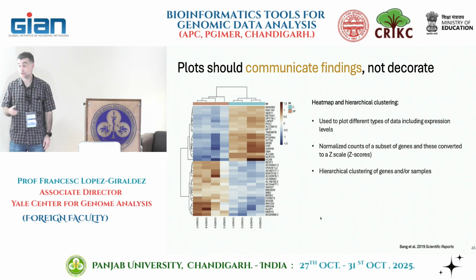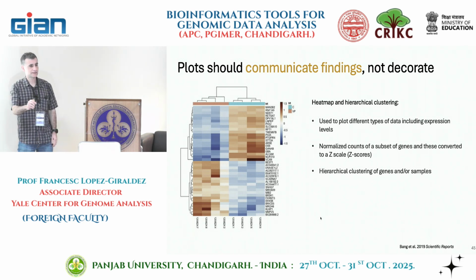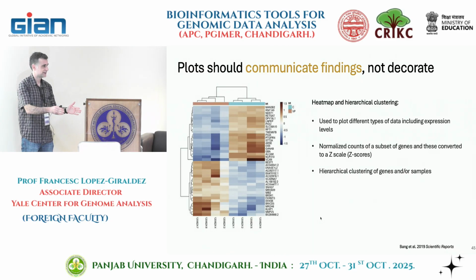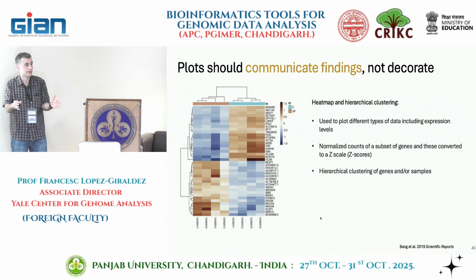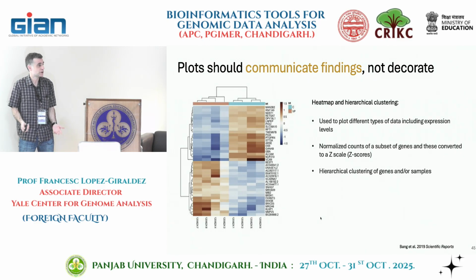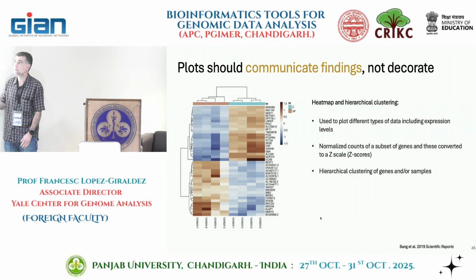I've seen papers, and I think this is one of them, that say, oh, I'm plotting a heat map with the genes differentially expressed. If you pick what generates differences, you get differences, right? In the PCA, we're not picking. We're taking pretty much everything and doing a plot. Here, I'm picking genes that created the difference, so you're going to see differences. So this is not telling us anything, absolutely anything, right?